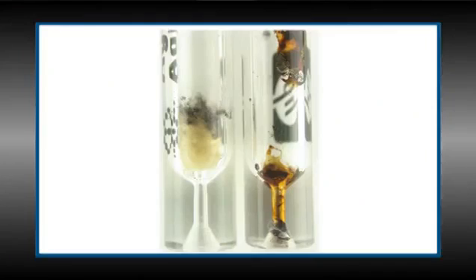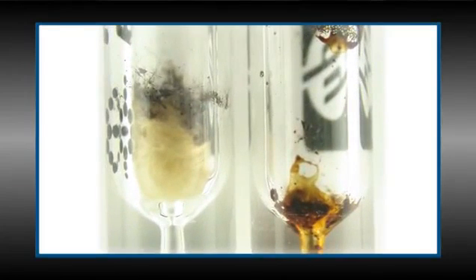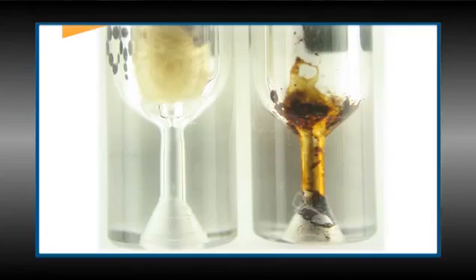You can also try a different liner with glass wool placed towards the bottom. Here's a picture that shows you what the glass wool in your inlet liner does. Contamination is caught in the glass wool and stays out of your GC system. This will help to trap any non-volatile contamination prior to even getting on the column. Sadly, it won't stop the semi-volatile contamination. Only baking out the column will remove that.